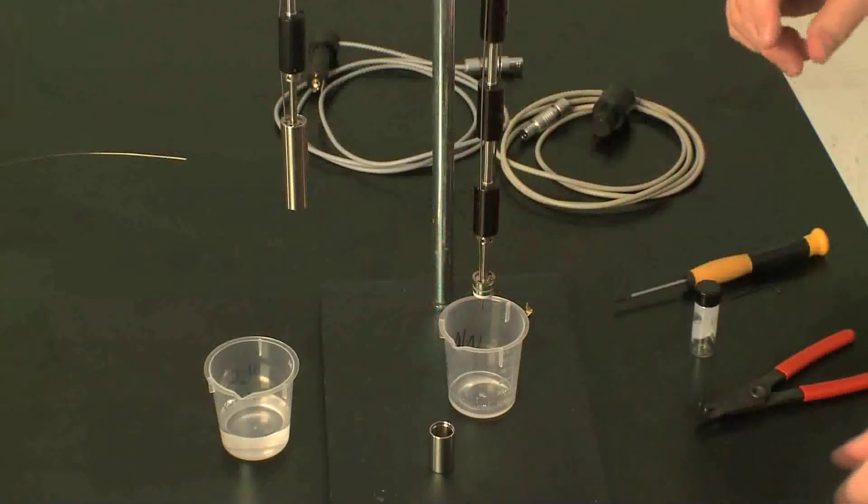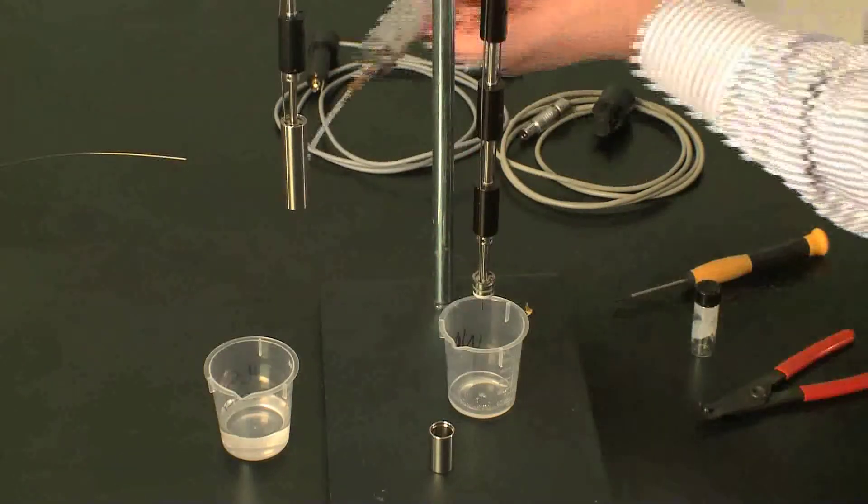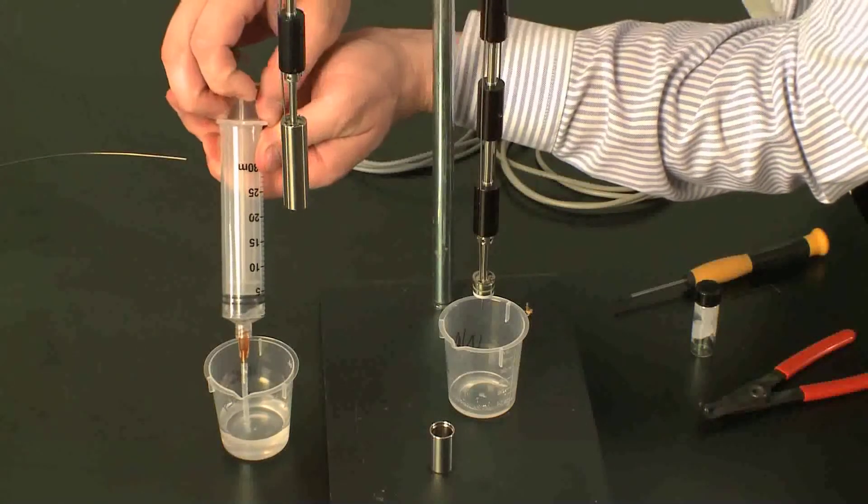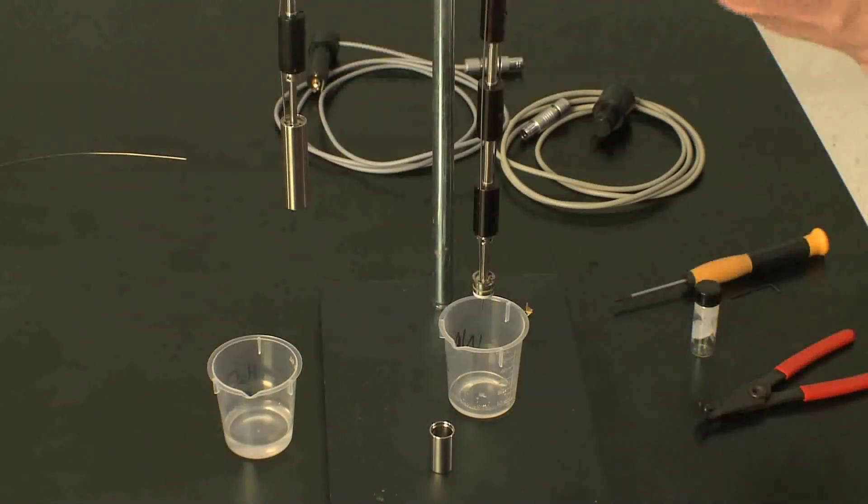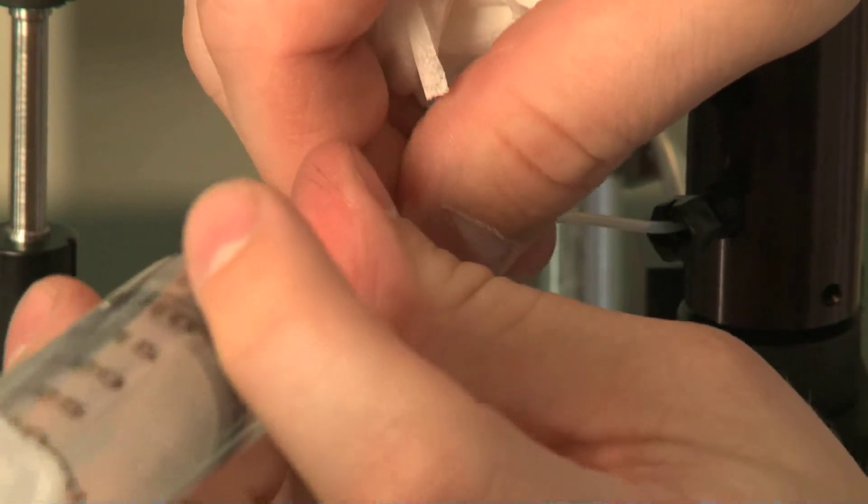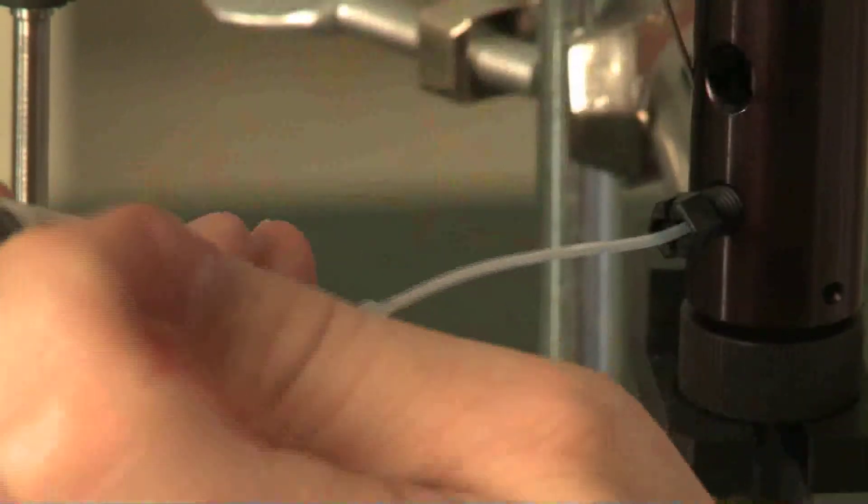We put a little waste beaker underneath the ampule. We're going to take about 5 to 10 milliliters of water and inject this water into the outlet of the ampule.